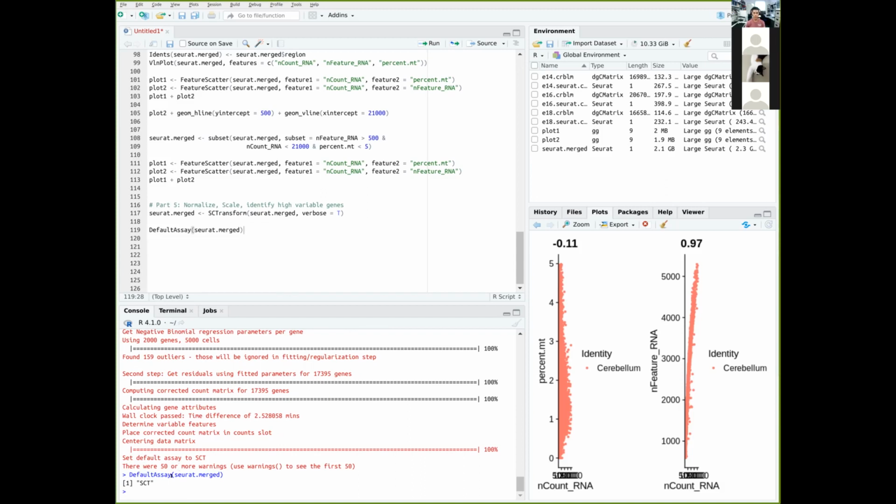And the reason is because SCTransform will create yet another assay within your Seurat object. And now it ports all the data from the initial Seurat pipeline into this new SCT assay. But don't worry because it's all an internal object. The porting is seamless. Everything will go on as expected. So you can continue on with the pipeline as though it is an RNA assay as previously.